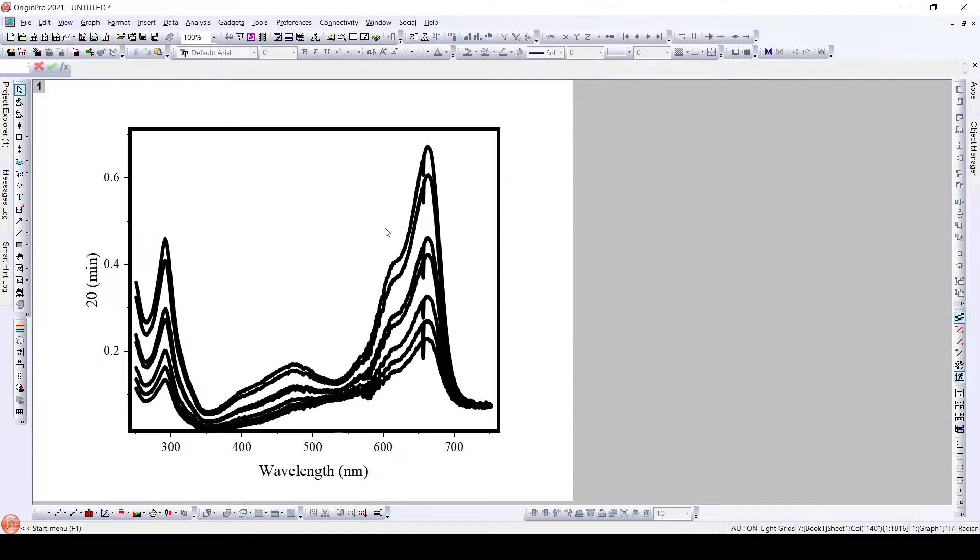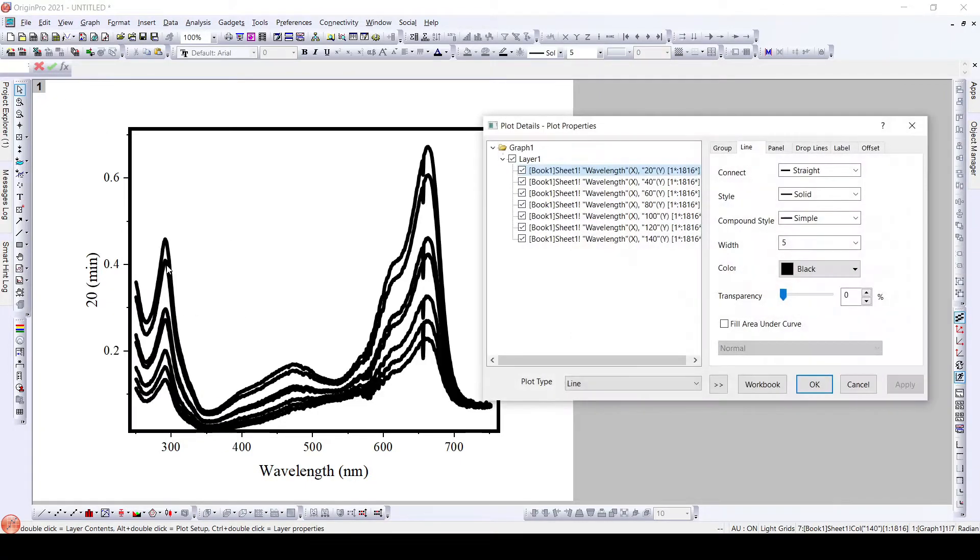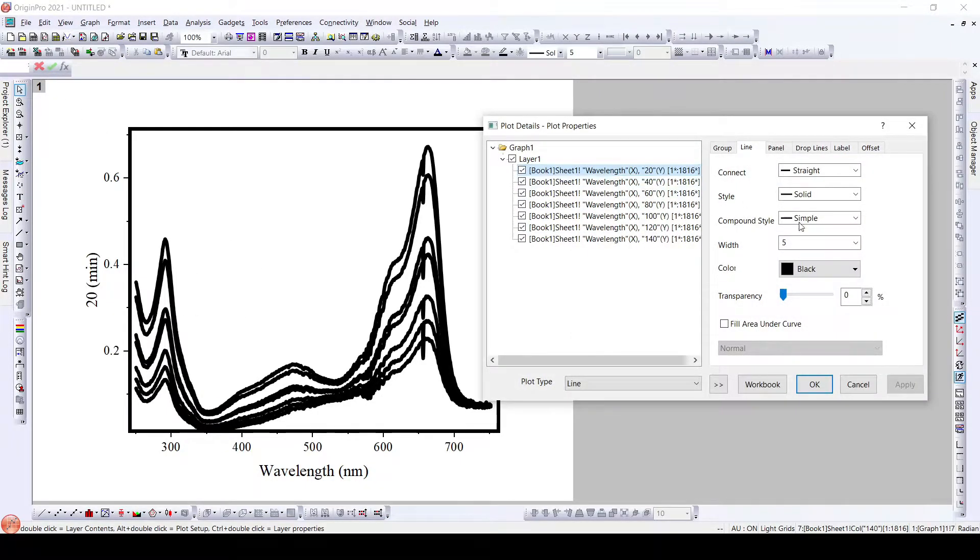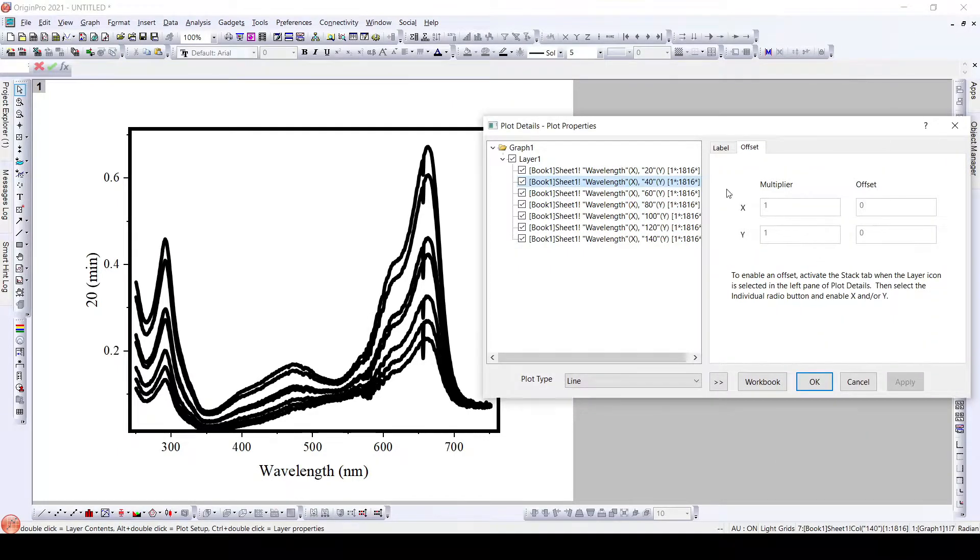In order to give different colors to different graphs, what we do is we can directly double click on this particular plot and then manually change the color of each.